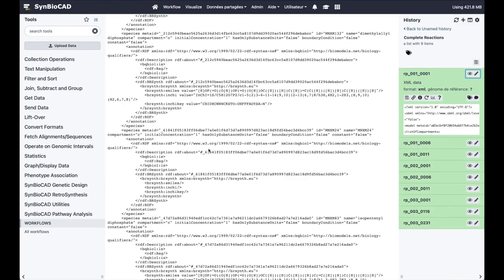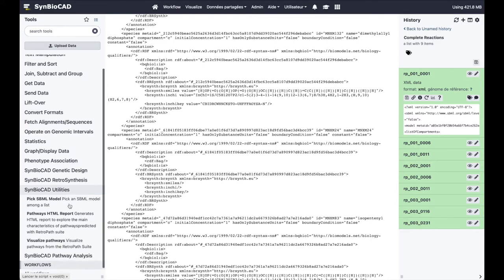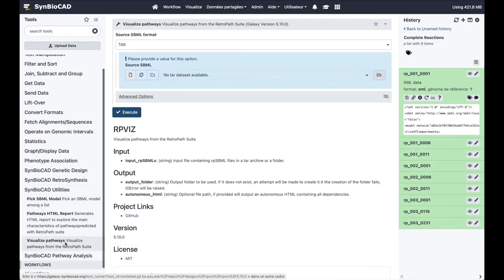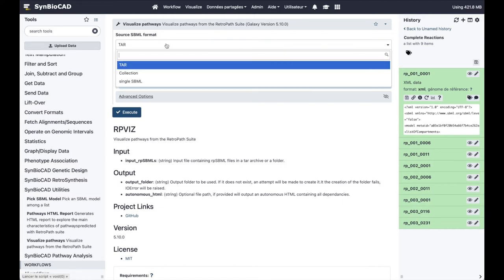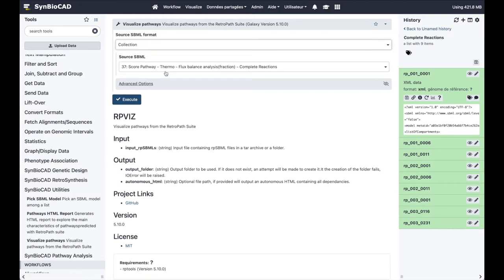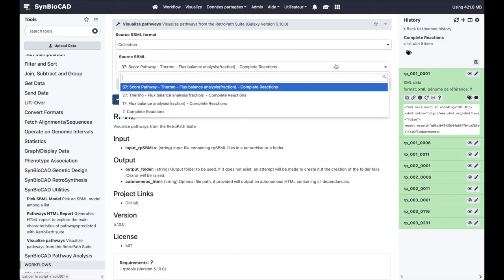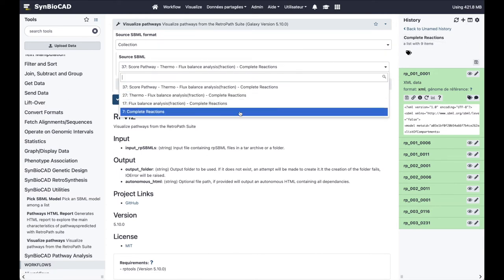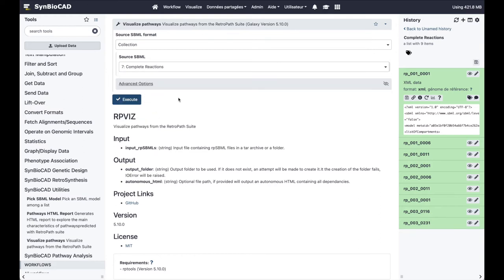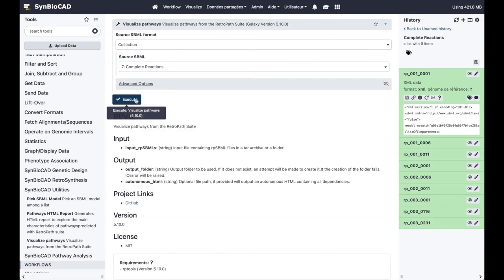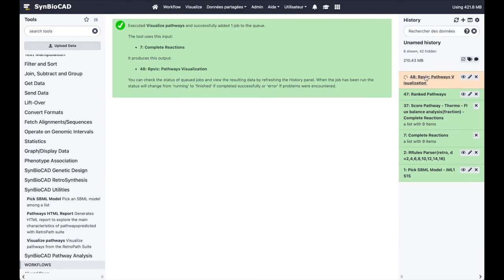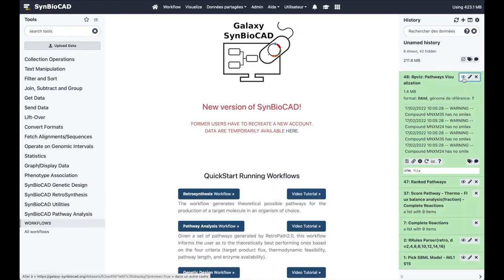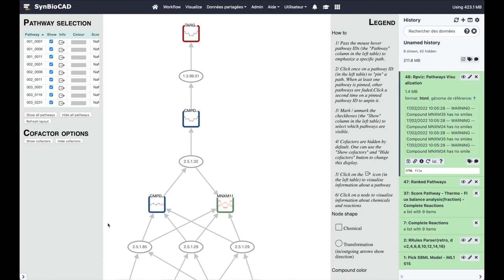We can also visualize the set of pathways at a glance by using the SynBioCAD visualization tool. By clicking on the icon the set of pathways appears and one can interact with it.